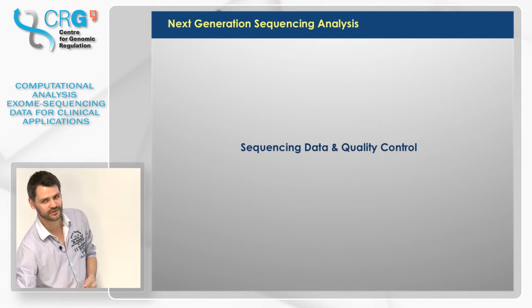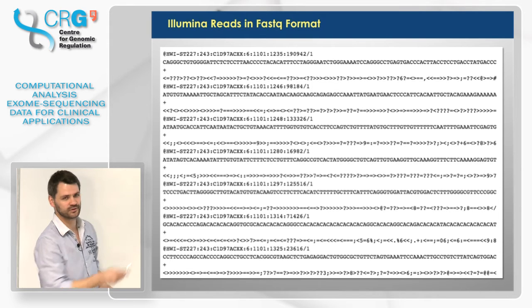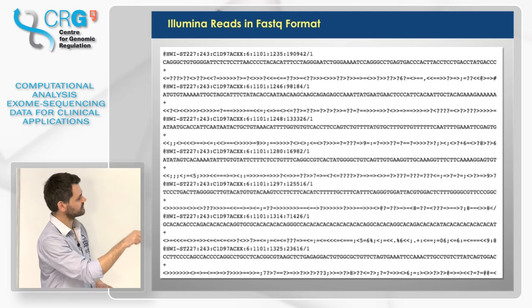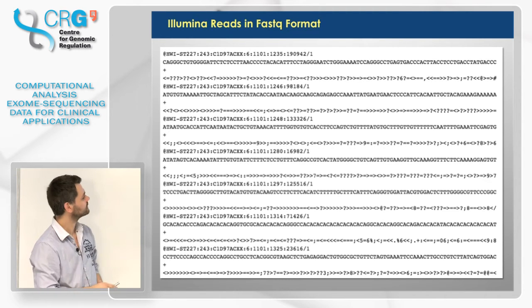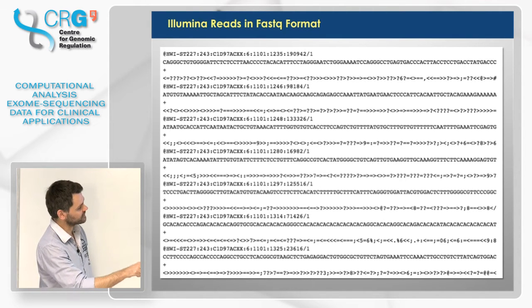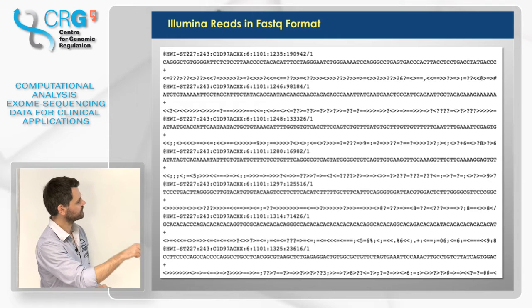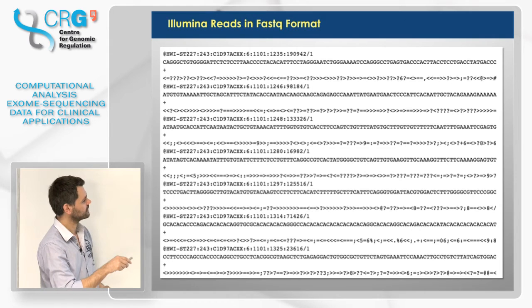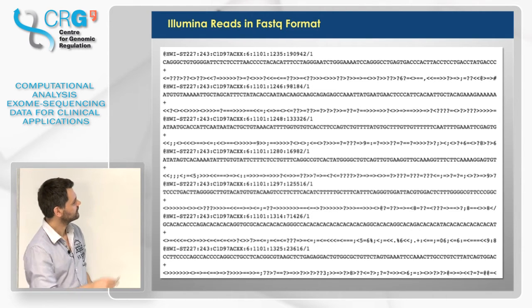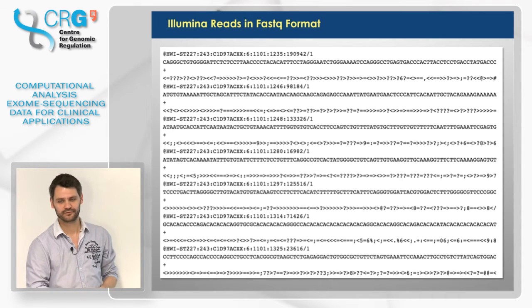So now we go step by step very quickly through the different types of analysis we have done yesterday and will do today. The first thing we did yesterday was look at the FastQ format, and we learned that this first column is the name of the sequence read, and it's constructed from the position on the flow cell and potentially some barcode. This read has no barcode here, but it could have, and then read 1 or read 2, and the name of your machine. Then you have the sequence itself. Then you have this filler line, which normally is just a plus and empty. And then you have the quality string, which is an ASCII encoding, which Mattia explained yesterday, that each of these stands for a value between 0 and 40. So this is one read, and then the next read, and the next, and then typically an exome has about 60 million of these reads.